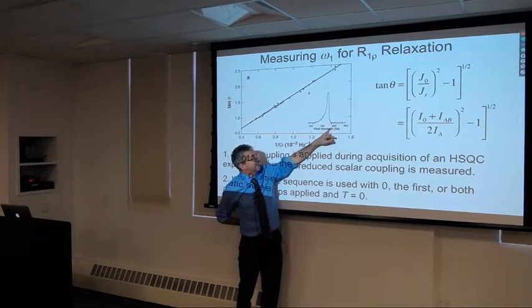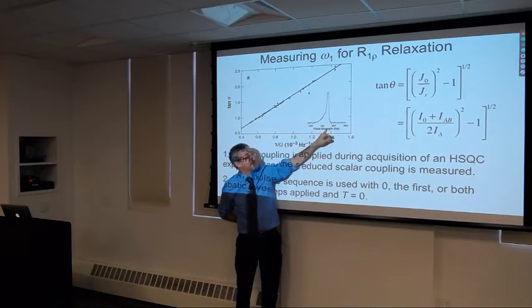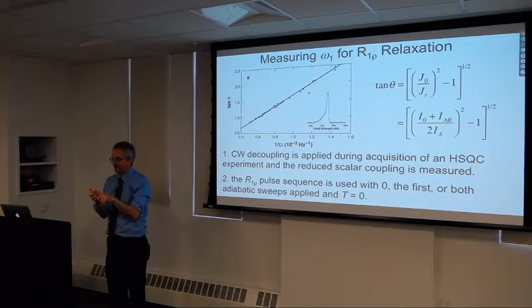This is the result of a nutation experiment. In a nutation experiment, we put the magnetization on Z, turn on the spin lock on X. For some time period, the magnetization starts to precess around the B1 field, and we then turn off the B1 field, apply a gradient so that we dephase the transverse magnetization, and measure how much Z magnetization is left.